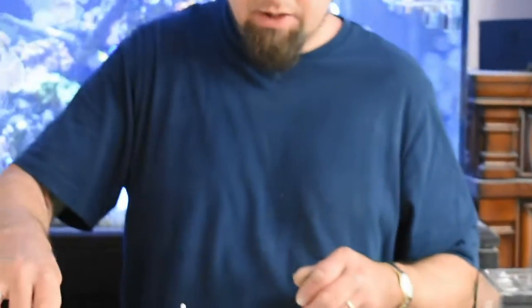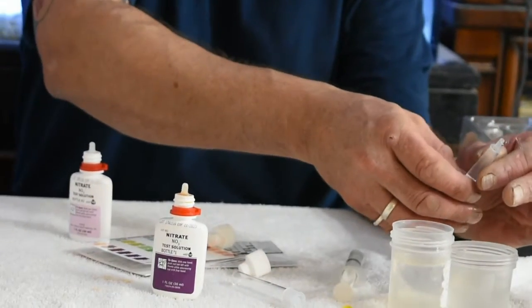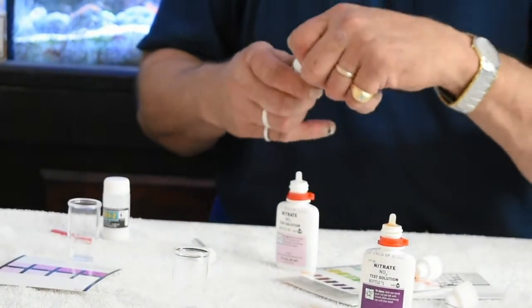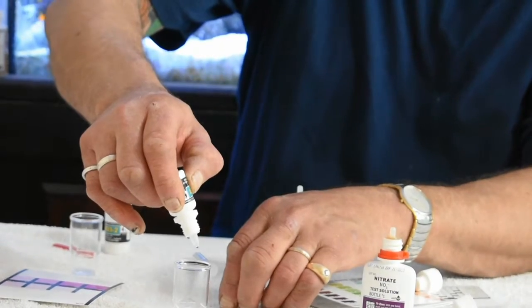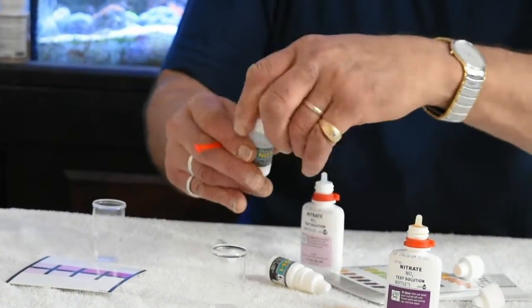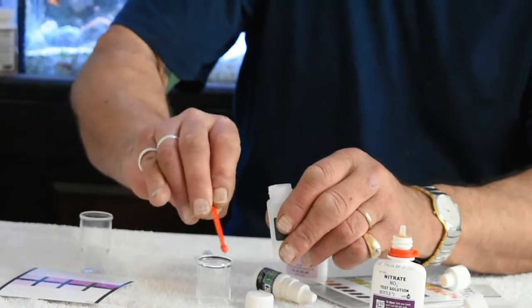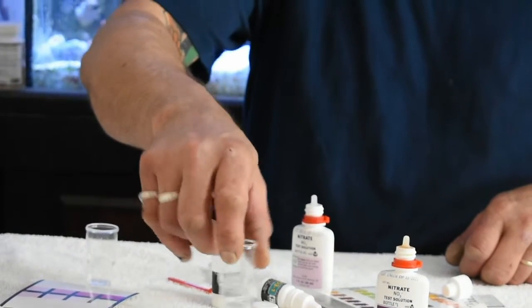Now let's go over here to the Salifert kit. One milliliter of water — both of these kits are brand new. And we have four drops, and we're supposed to put in one spoonful of the powder. Swirl that up, and here again we're waiting about three minutes to get our results.